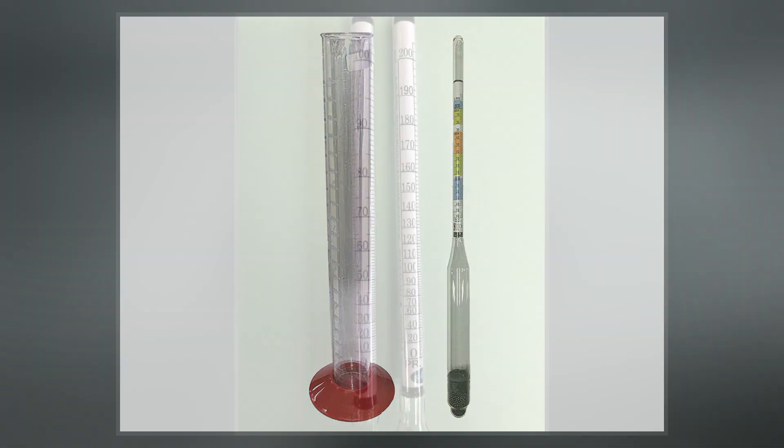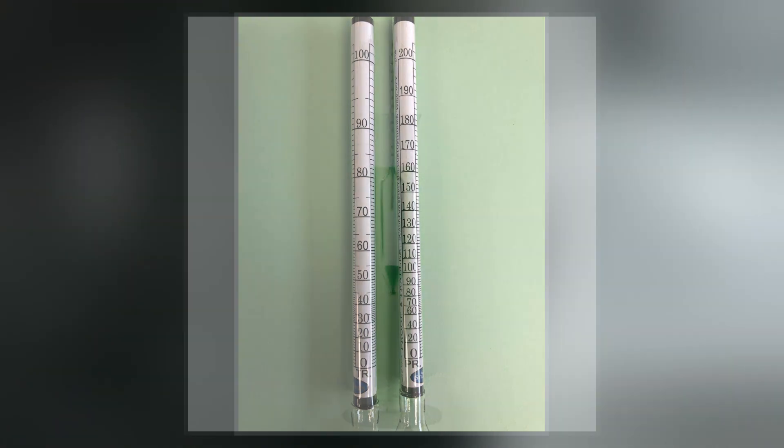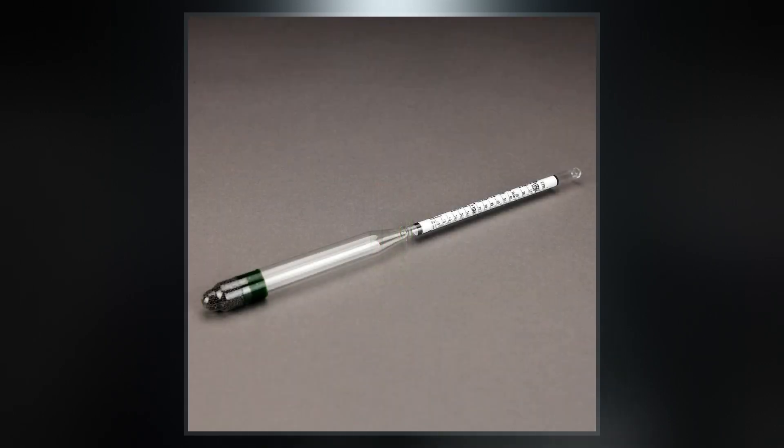Hydrometers can contain any number of scales along the stem corresponding to properties correlating to the density. Hydrometers are calibrated for different uses, such as a lactometer for measuring the density of milk, a saccharometer for measuring the density of sugar in a liquid, or an alcoholometer for measuring higher levels of alcohol and spirits.